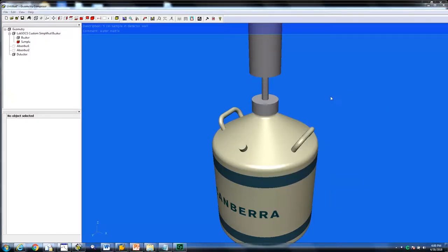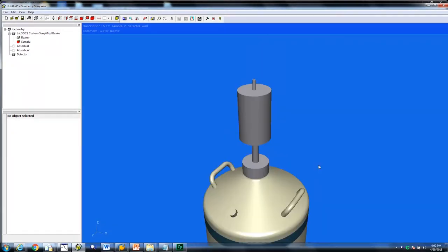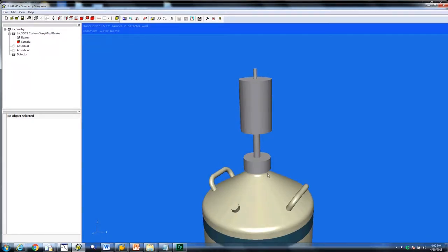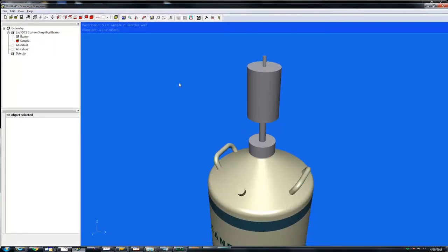You will now see an image of a container inside the well detector. We will now use the geometry tree located on the left-hand side of the application to make the detector rendering transparent so you can see the beaker inside.